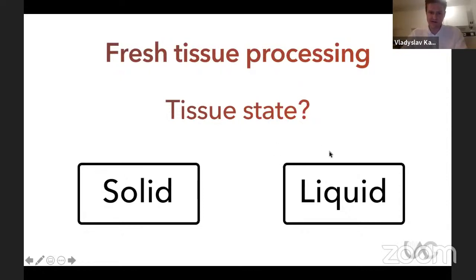The most frequent that you will be working with is liquid. A lot of the single cell RNA sequencing pipelines are focusing, for example, on processing of blood, like PBMC samples. In our research, we are also processing the cerebrospinal fluid of patients with multiple sclerosis. So a lot of them just focus on liquid tissues, but of course you can plan your experiment to start with solid ones. So let's start with the easier one.